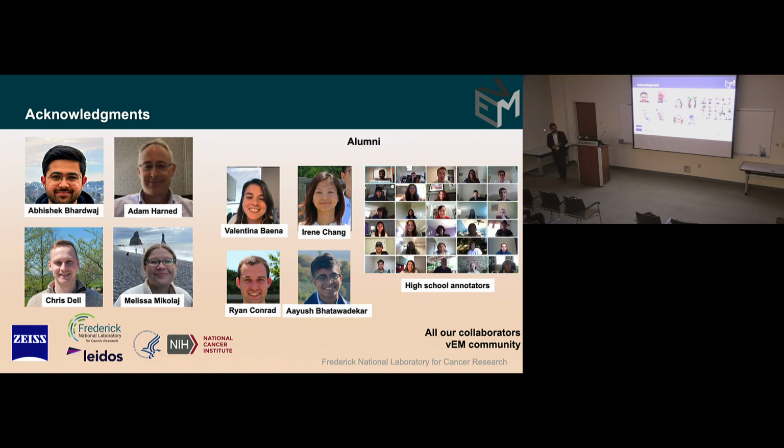And if it's not working great, do you usually just give it more ground truth? Yes, usually. There's a module called fine tuning. I had a movie, I should have included that. But if it does reasonably well but not good enough, you say, okay, here are 10 examples where the model failed. So you would specifically choose areas where it didn't do well, give it the corrected ground truth, and run it again. We show repeatedly that that works.